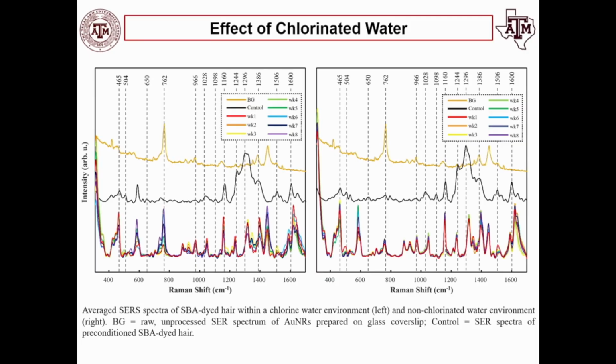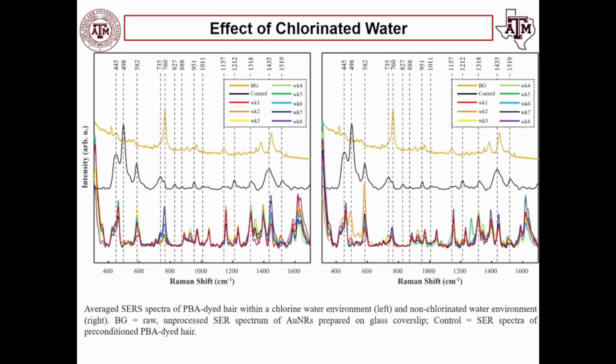And therefore, if this happens, we can have the leaked dye overwhelming the spectra acquired from hair that were dyed by another colorant. And as you can see here, it's exactly the case. So in case we have hair colored with a very strong dye, the signature of this dye can mask the vibrational signatures of other colorants present on hair.